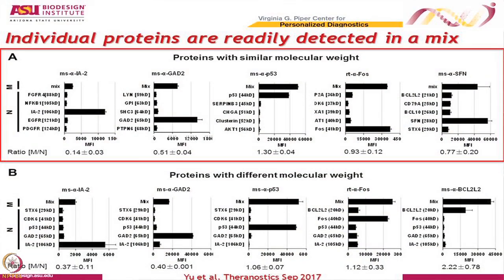All right. So here is an experiment, let me walk you through it. On the top where it says M, that stands for mixed NAPPA or multiplex NAPPA, we printed a mixture of 5 genes and then expressed them. And then we also, on the same slide, separately printed each of those spots individually. Then we probed that array with an antibody that recognized one of the proteins in the 5 and asked, even though it was expressed in the mixture, did we detect it? And did we detect it as well in the mixture as we did individually?